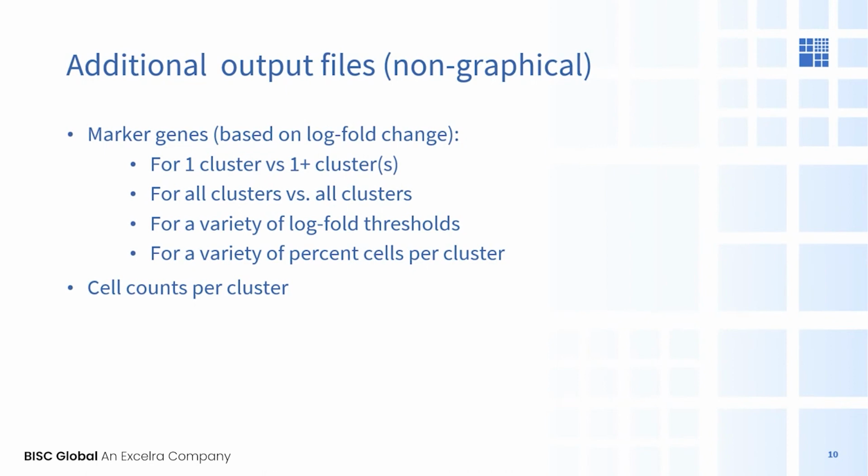And in addition to all these graphical figures that we've seen, there's also a lot of charts and tables that are standard output for single-cell analysis, such as charts of log-fold change expression across clusters, whether grouped by metadata features or by just their numerical cluster number, with various cutoffs, and also the cell counts per cluster. So like I said, if you want to get more information on any of these standard figures, there are a lot of tutorials and vignettes for Seurat available on the Seurat website and elsewhere.